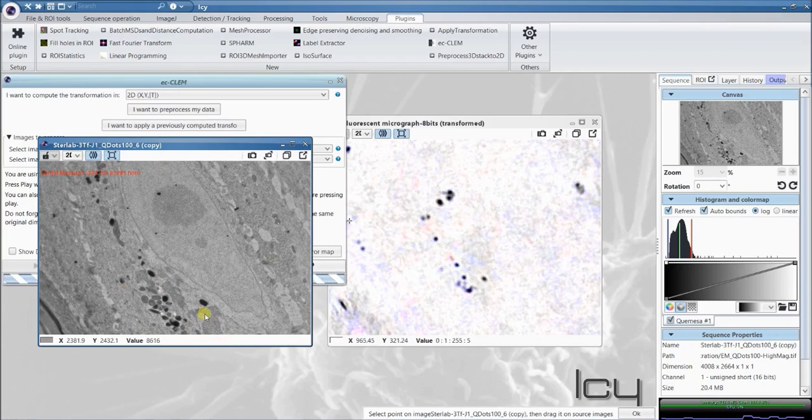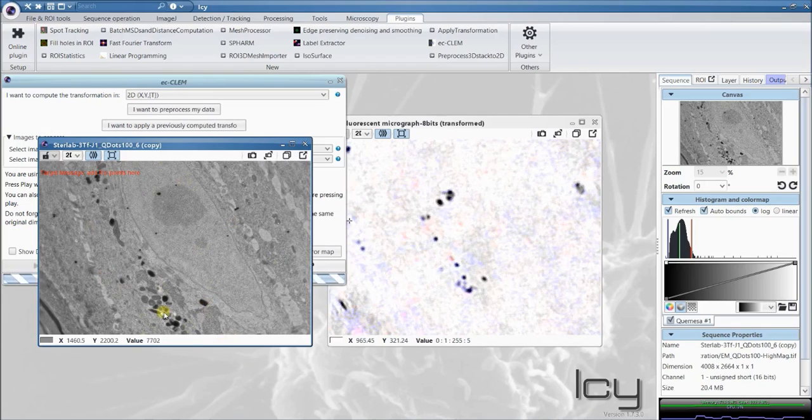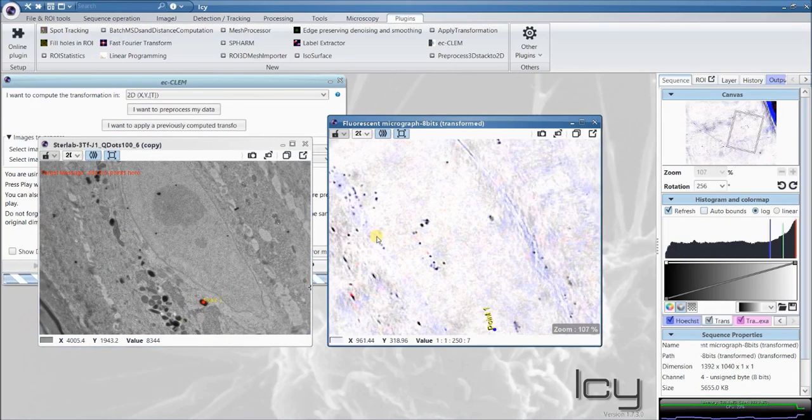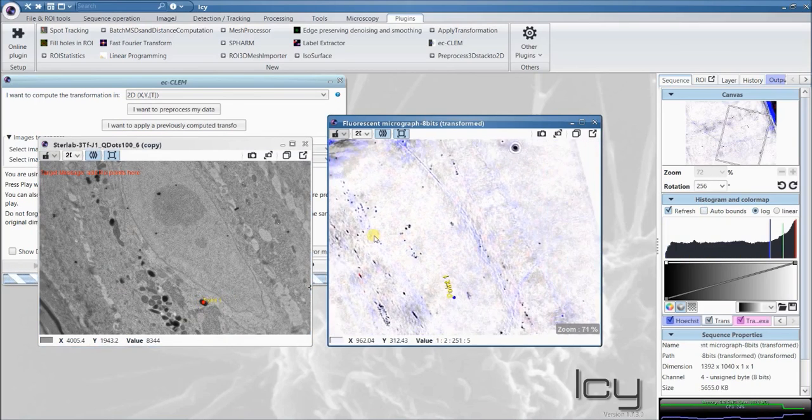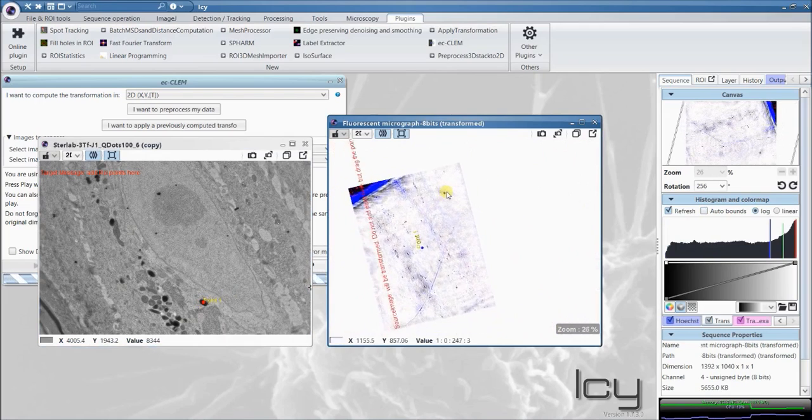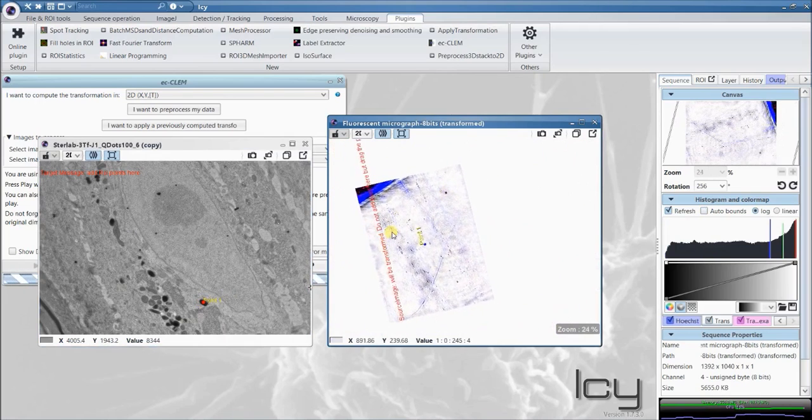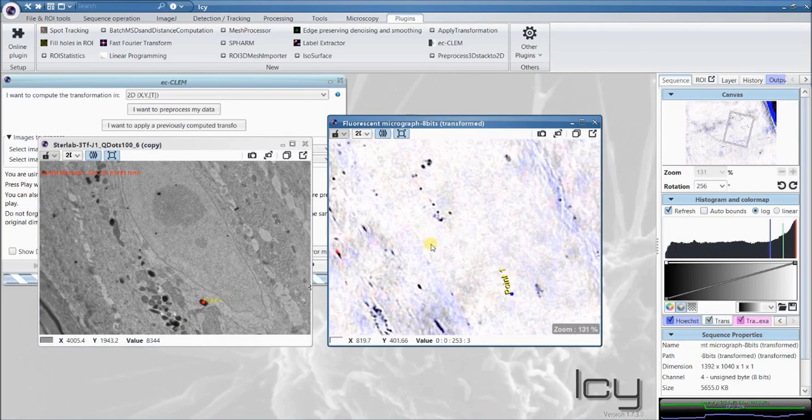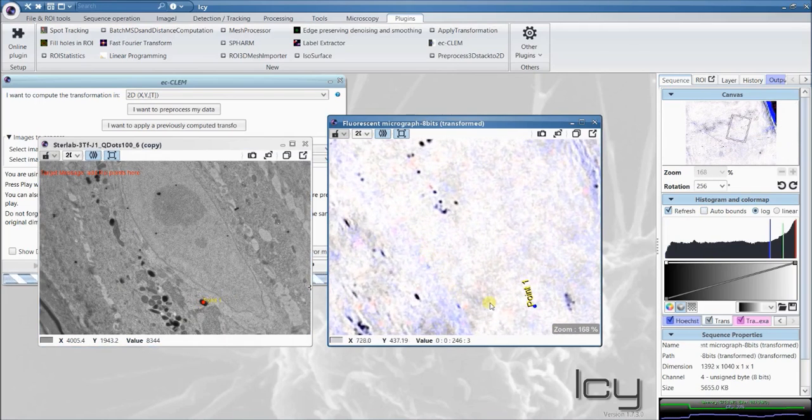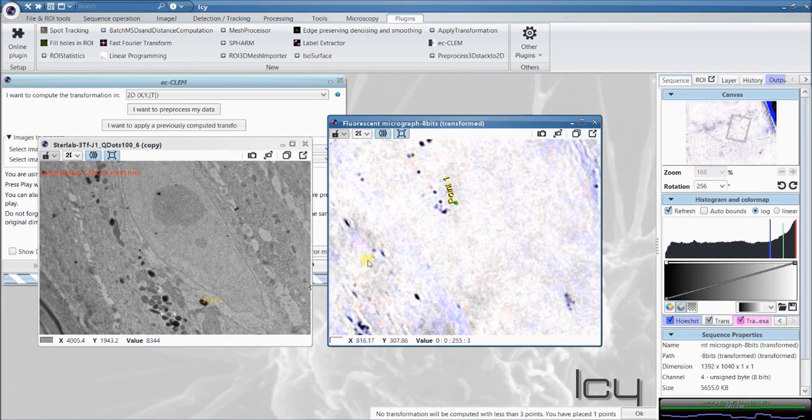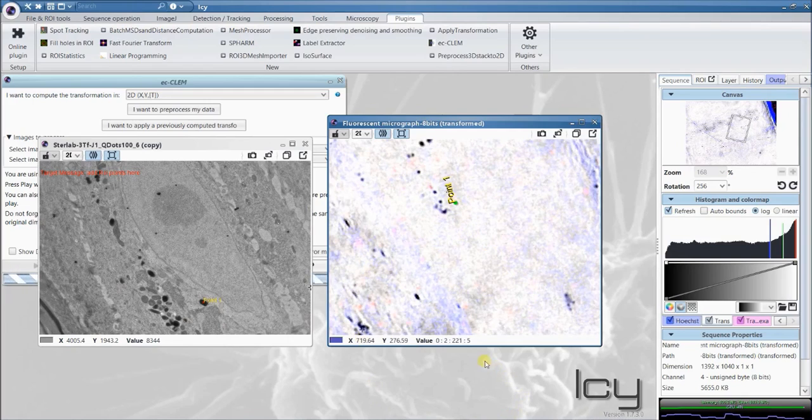When you start the plugin, the first thing you have to do is place the points on the target image and not on the source. Here, I'll select, for example, this melanosome, and the point will be placed in the center of the image because it has no prior knowledge of where to place it. Take it, drag it, and drop it. No transformation will be computed before we have enough points to do the transformation.